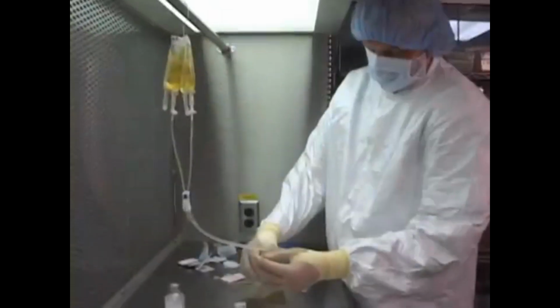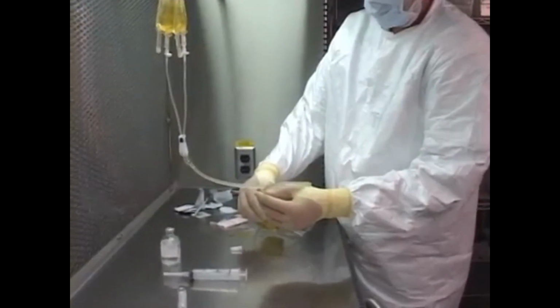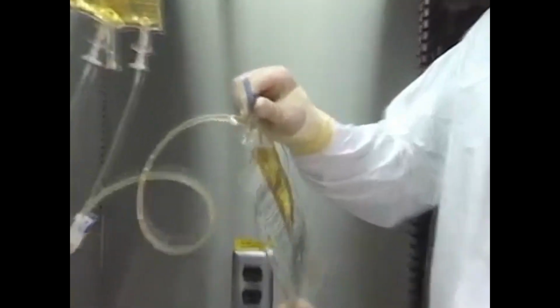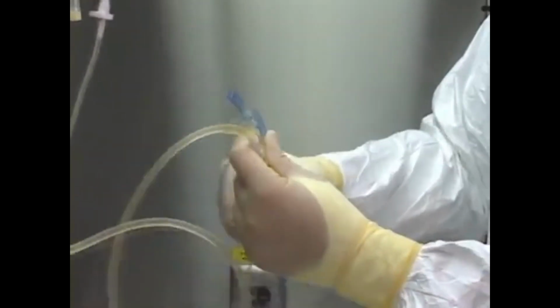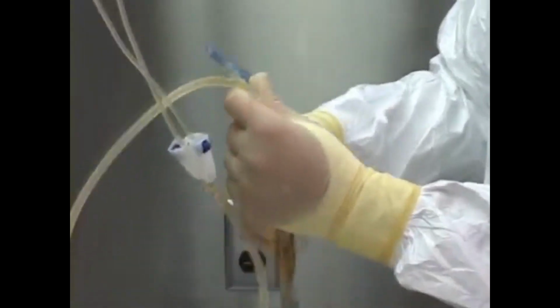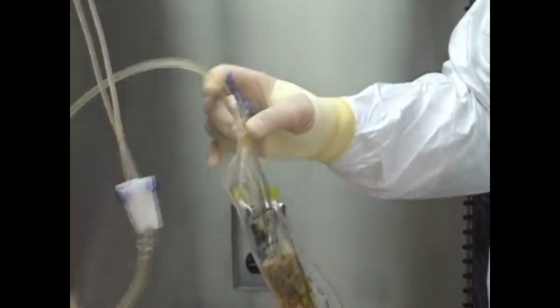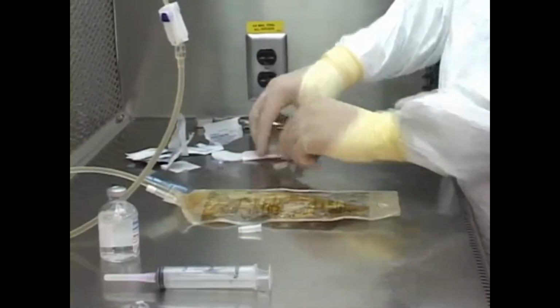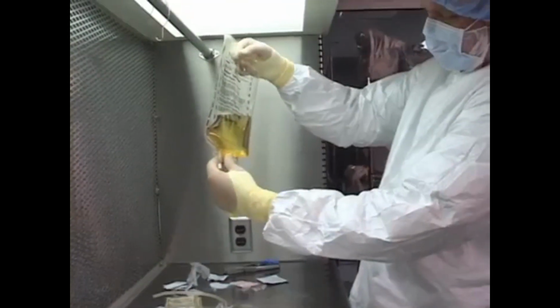Another method is the underfill method. This method uses commercially available underfilled bags, which are partially filled with concentrated dextrose solution. A bottle of amino acids is connected to the underfilled bag by a tubing set and infused into the partially filled bag. With either method, other components are added by injecting them through an injection port into the final container. This is usually the final step before labeling and dispensing.